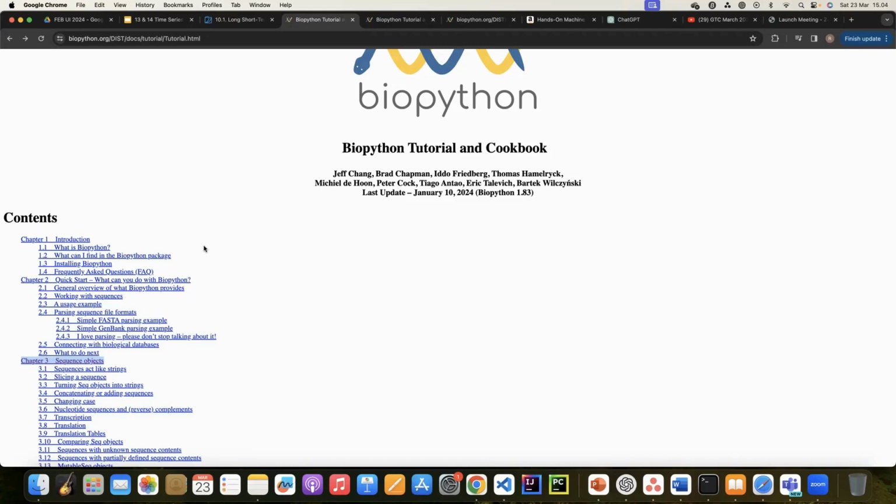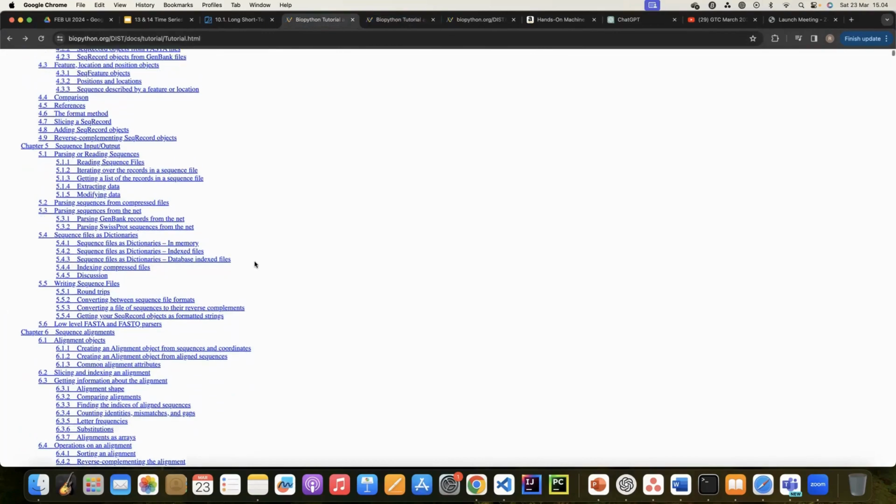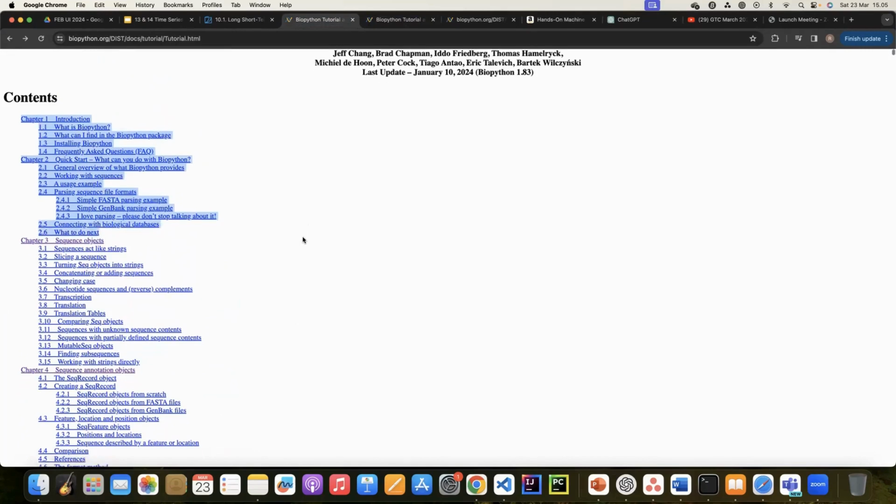Before we continue with Galaxy, I just want to remind you that Python has a lot of features. Initially I introduced Biopython, and I hope you can start using Biopython to download data from NCBI or EBI or DDBJ, all of the public GenBank data. Once you get the data, like FASTQ or FASTA files, or files like SAM, BAM or VCF, then you can start to manipulate it.